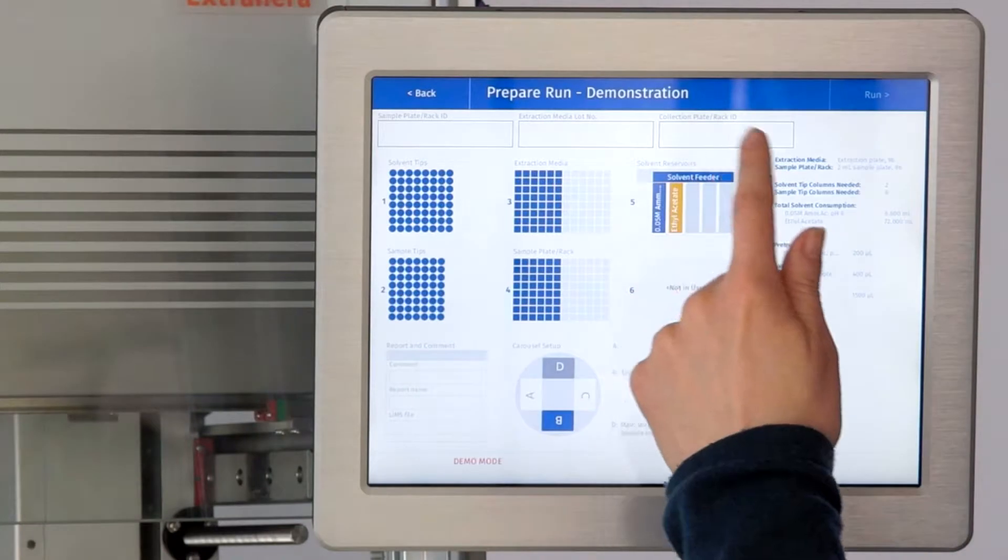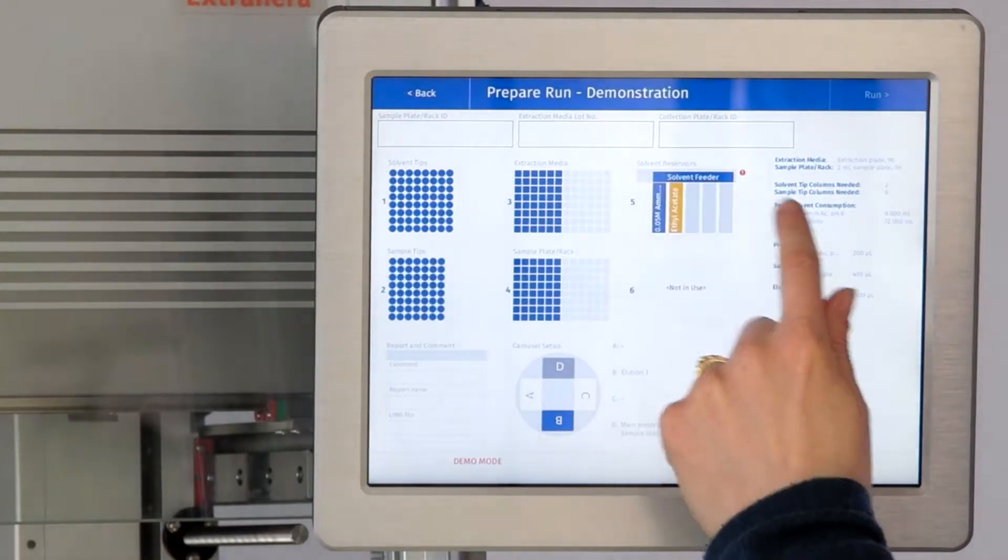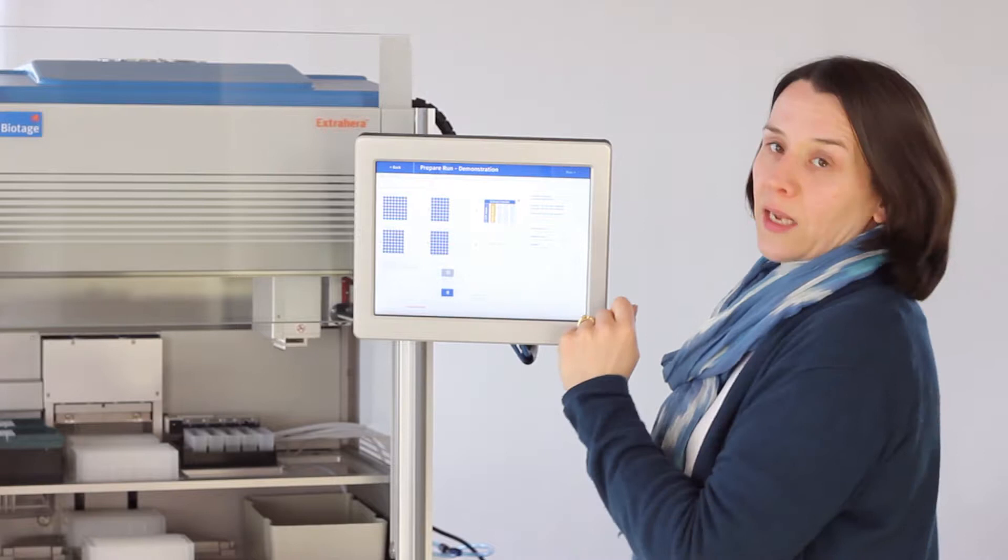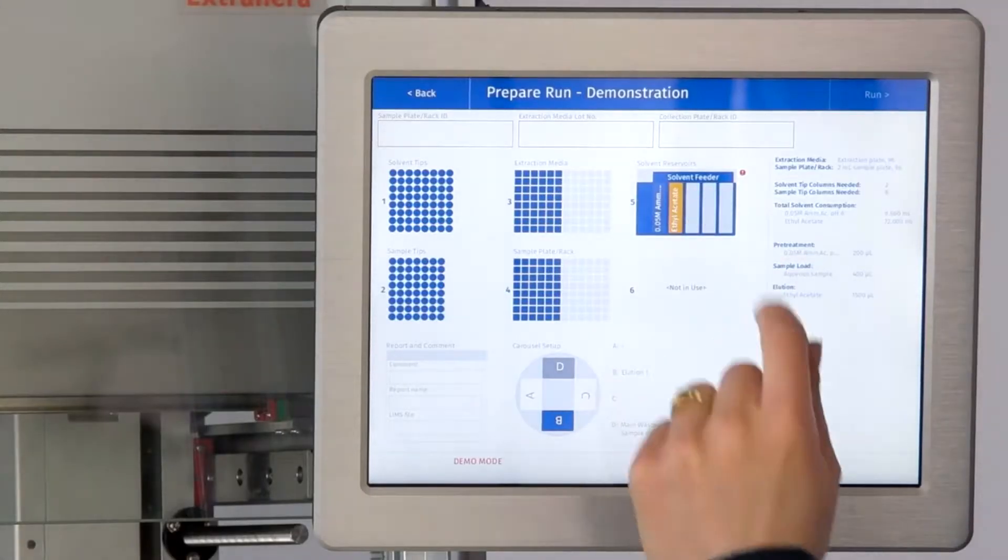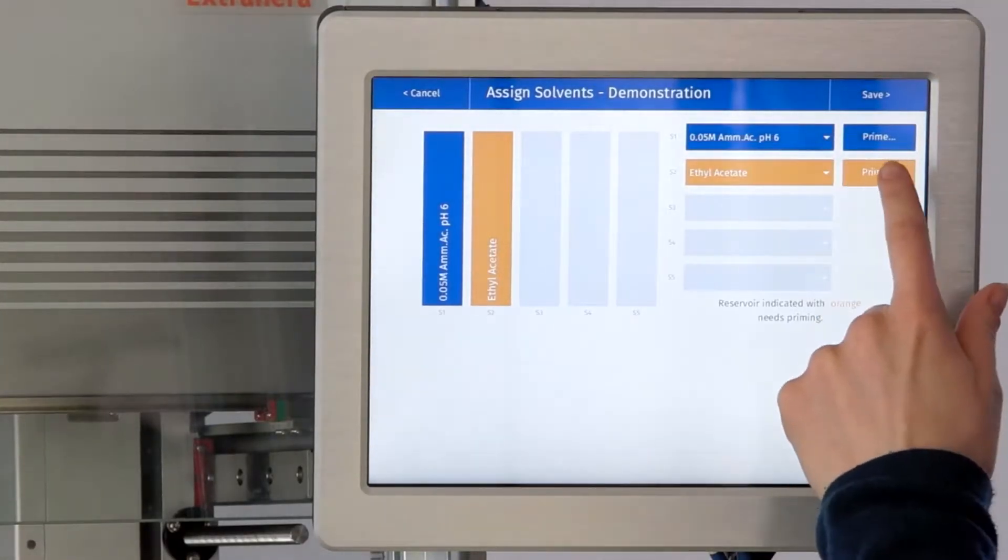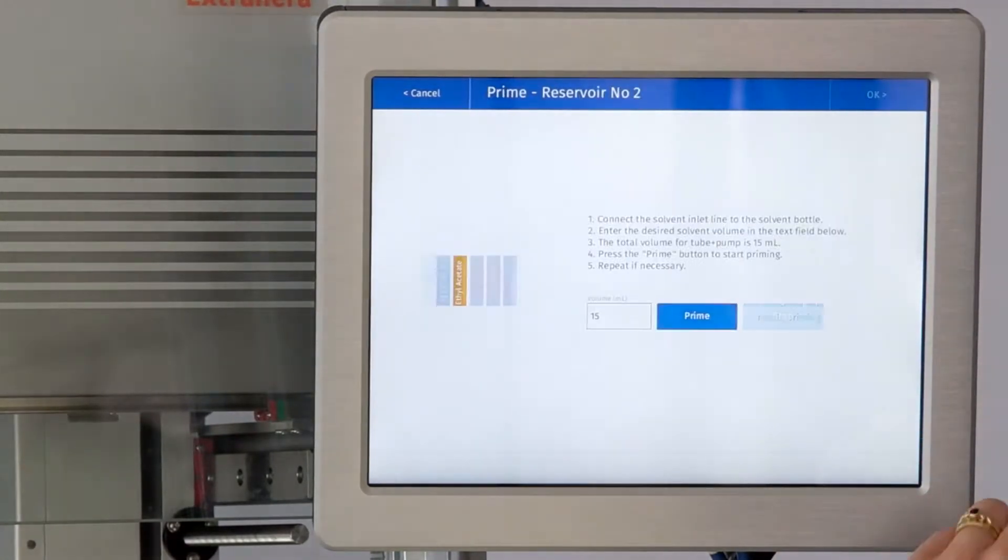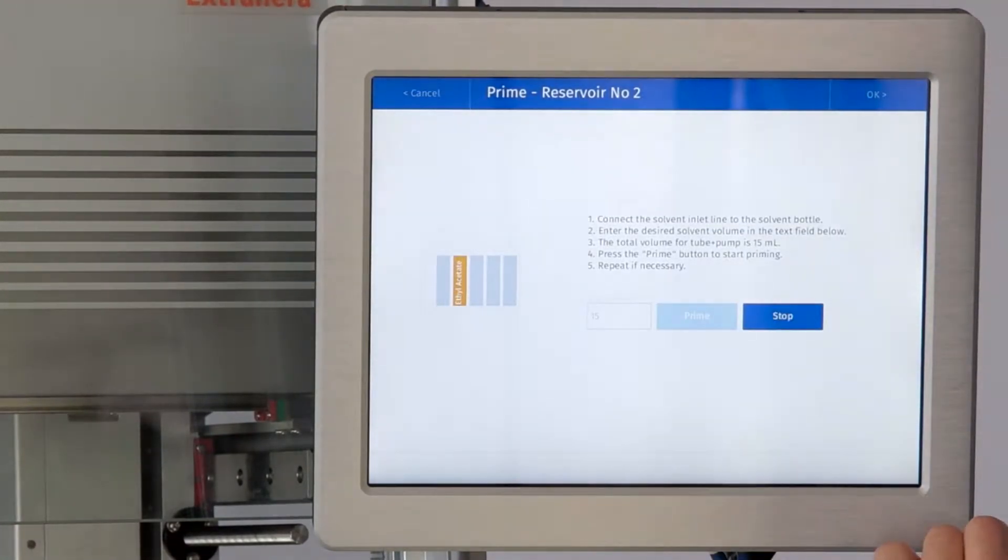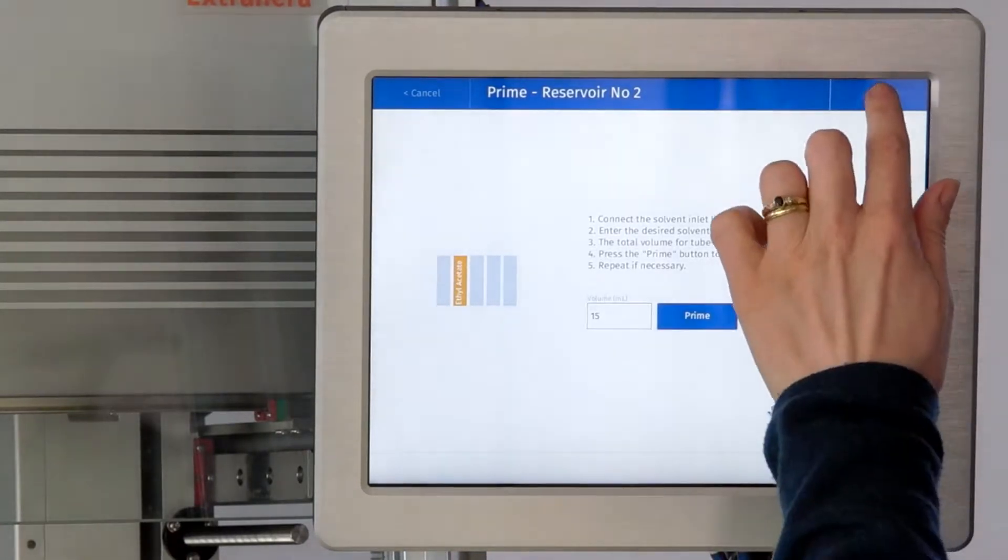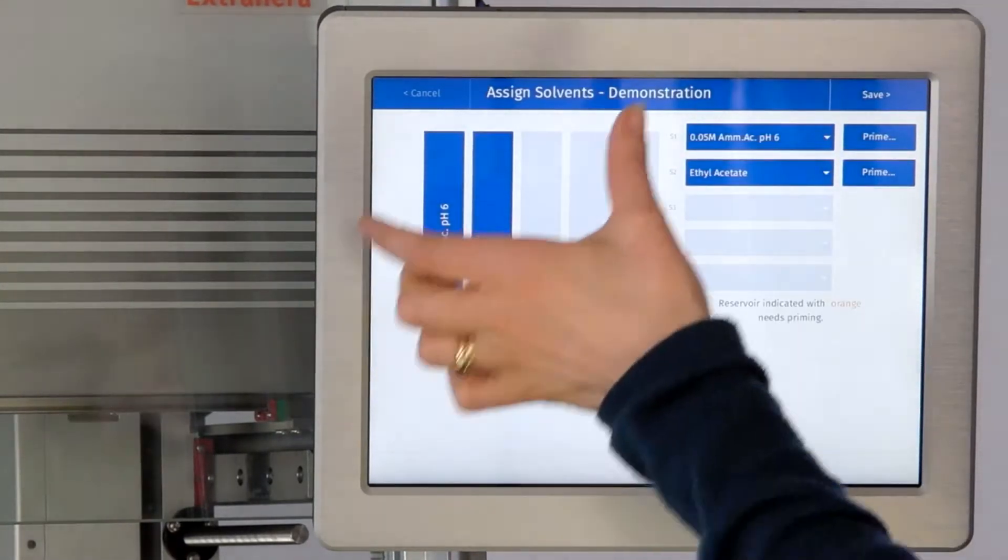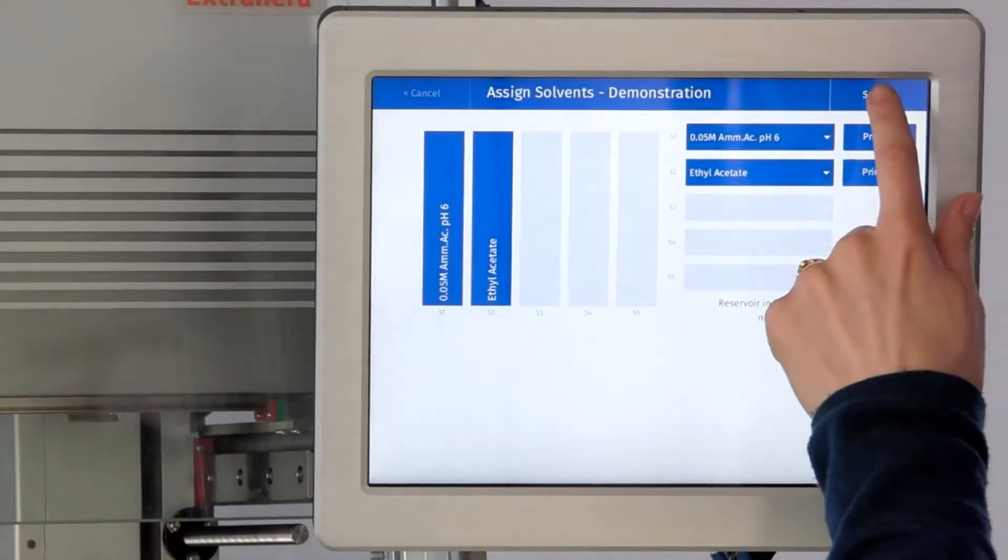Also we've got the solvents, and this one is telling us that we haven't used ethyl acetate on solvent reservoir two. So we'll pick it up and we'll prime that solvent. Now when we go back to the screen we'll see that everything is blue and is fine to go.